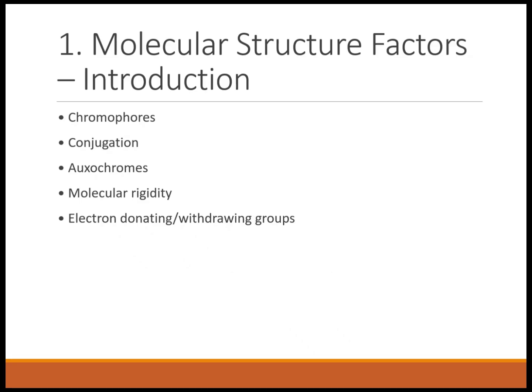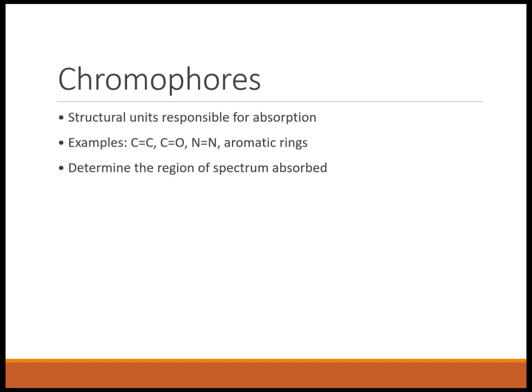All these factors determine the intensity and wavelength of absorption.